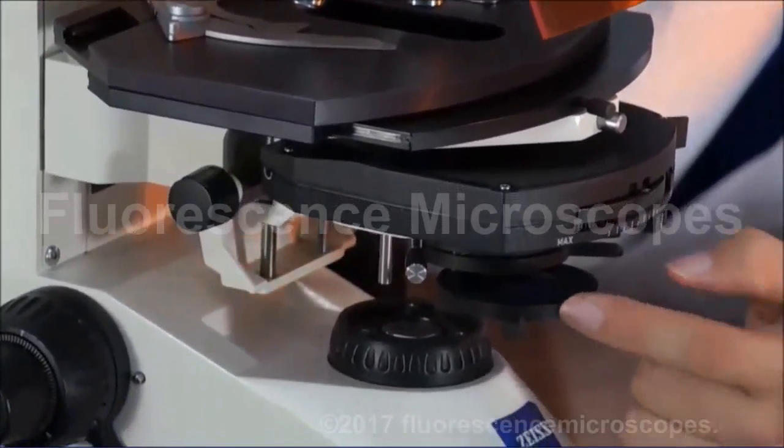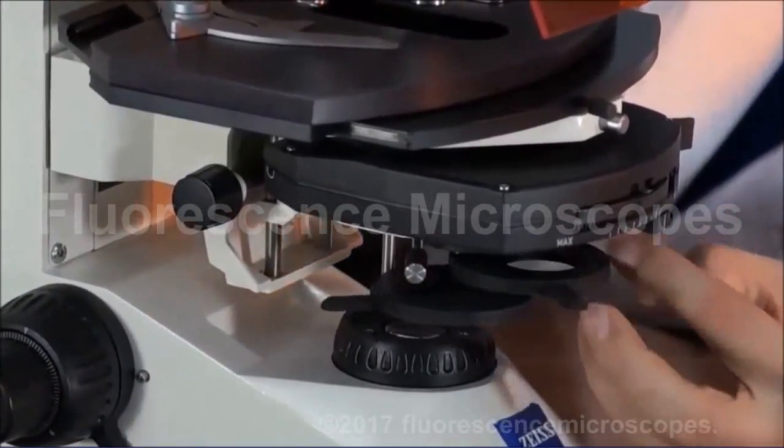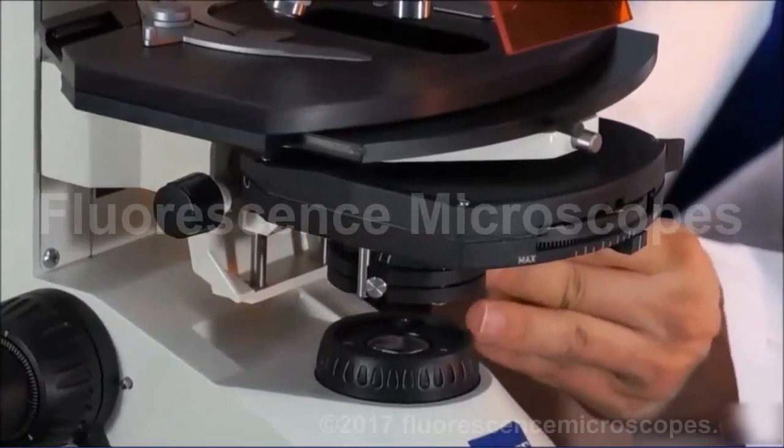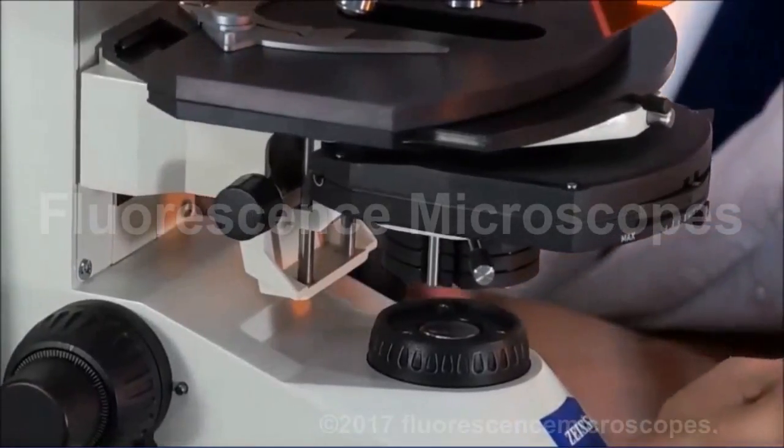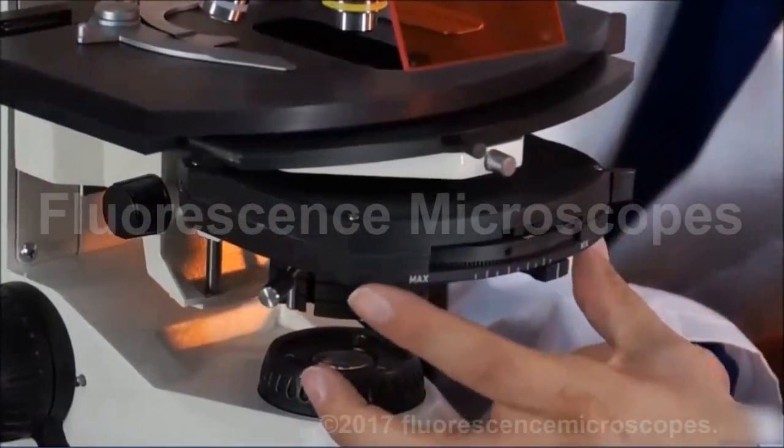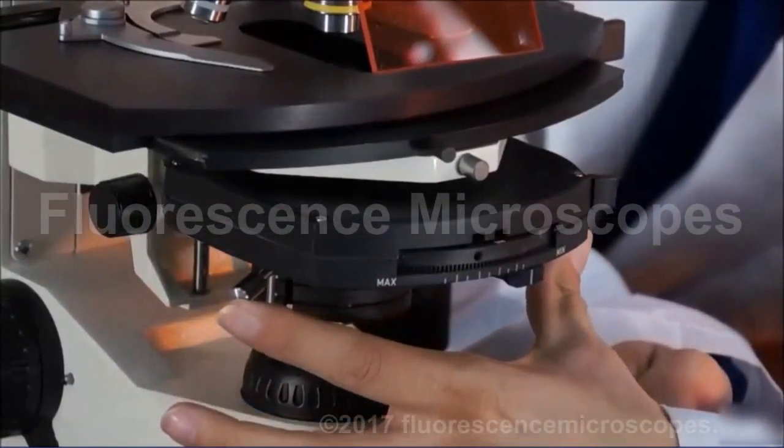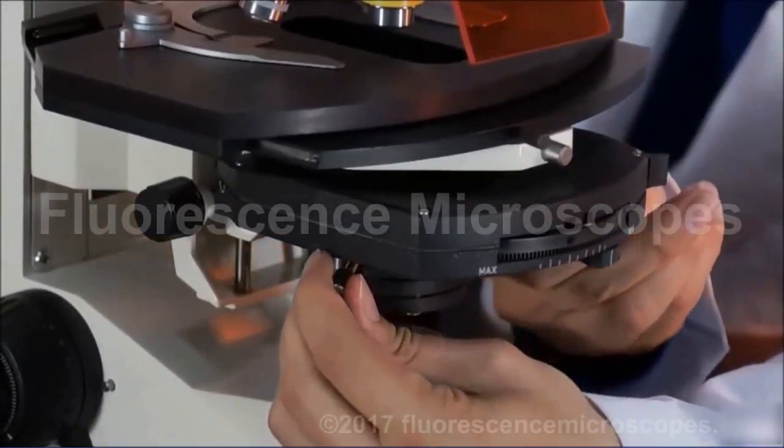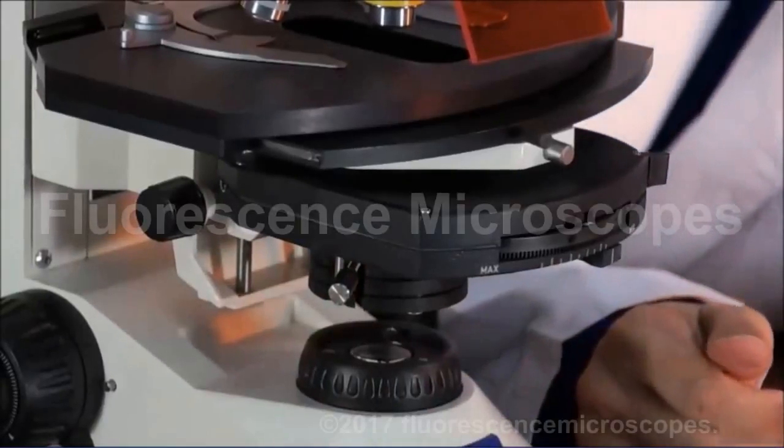I do see a daylight blue filter. Looks like that's the only one. You've got condenser centering knobs right here. You're going to center this to get it in proper Köhler illumination.